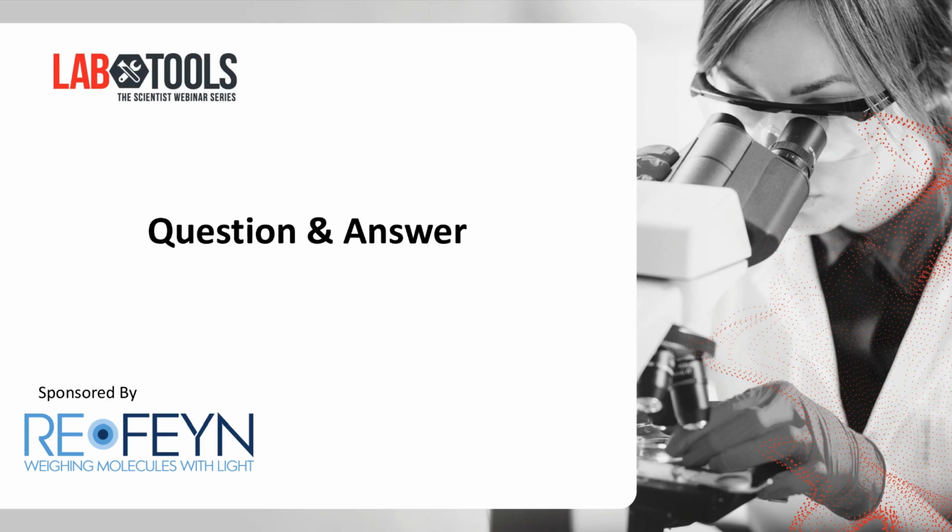Could you try to model the interaction with only the part of human ACE2 that interacts with the RBD rather than the entire molecule? So I didn't mention explicitly, but the ACE2 construct that we use, you could truncate the ACE2 domain. We were hesitant on doing that for the same arguments of the IgG versus the Fab. So for us, we studied the dimeric.